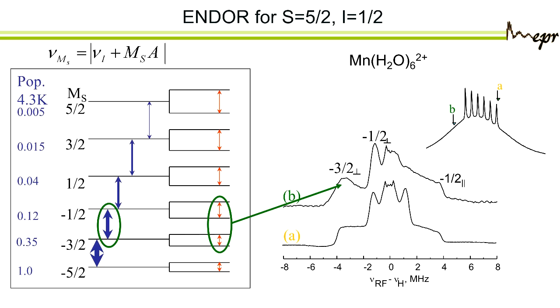And then we see a Pake pattern due to the -3/2. And you see that it is broader and it has the right ratio. Okay, and from this actually you can really get the sign of the zero field splitting. You have to move on.